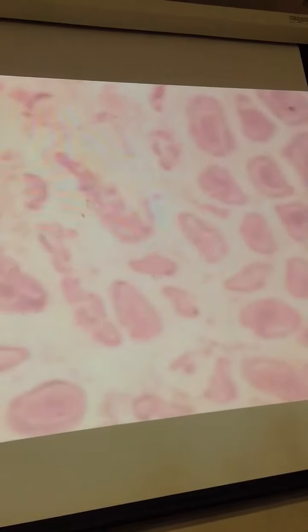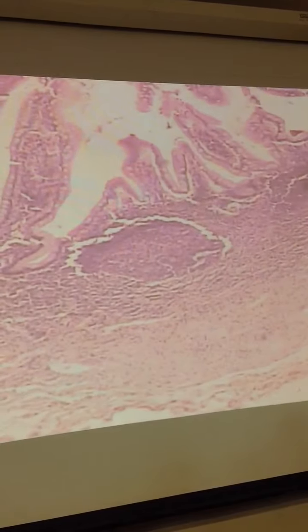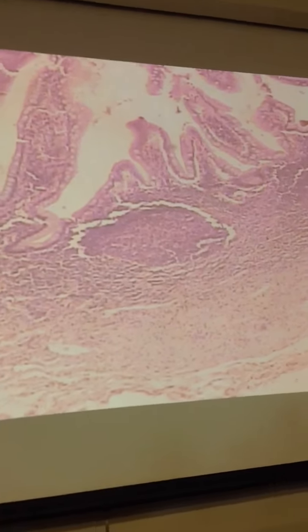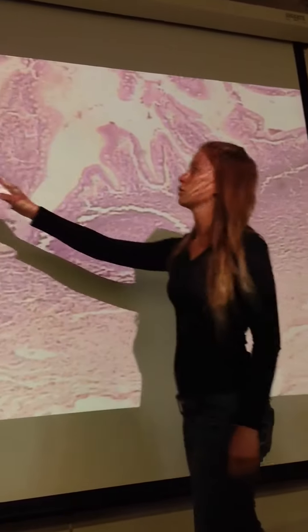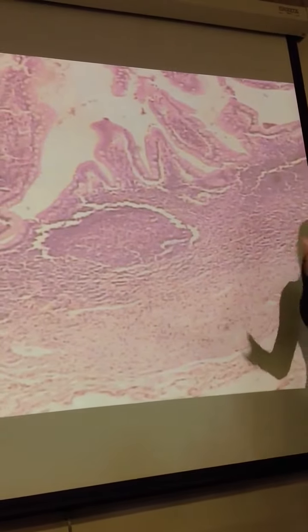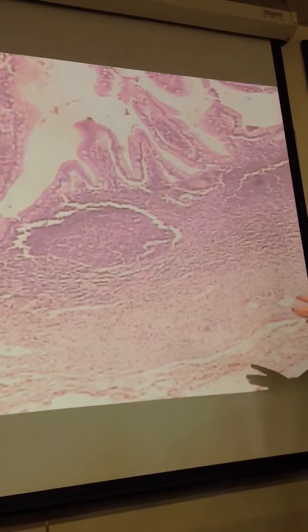So keeping in mind what we just saw, we'll look at the ileum, and we'll be able to see that the structures here, the Peyer's patches, are very different. I love it when I immediately go to it, it makes it so much easier. So if you look in the submucosa, just to orient you here, here's the mucosa layer, definitely a lot less thick, right? The duodenum is that first portion of intestine, so that's where you get the vast majority of your absorption taken care of.